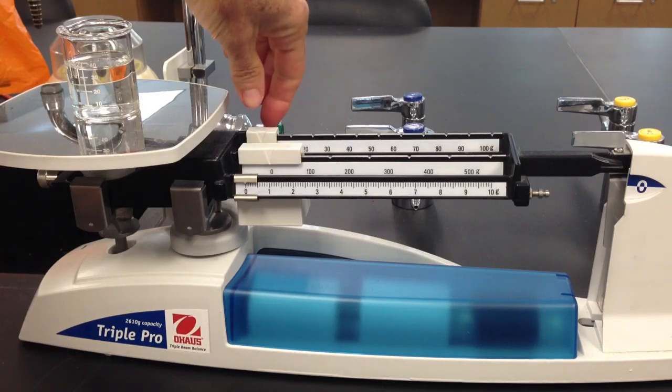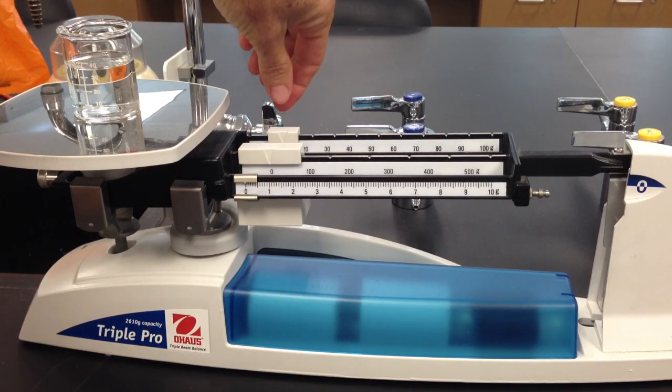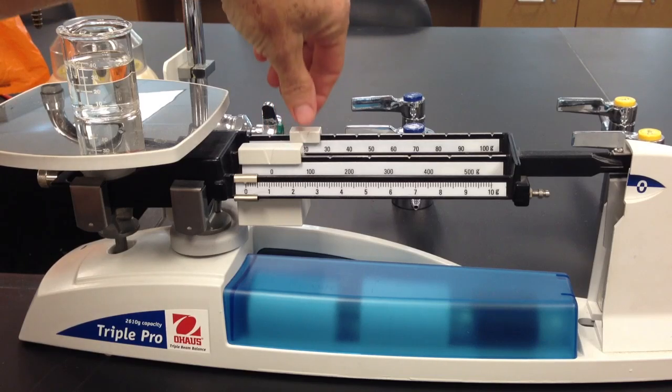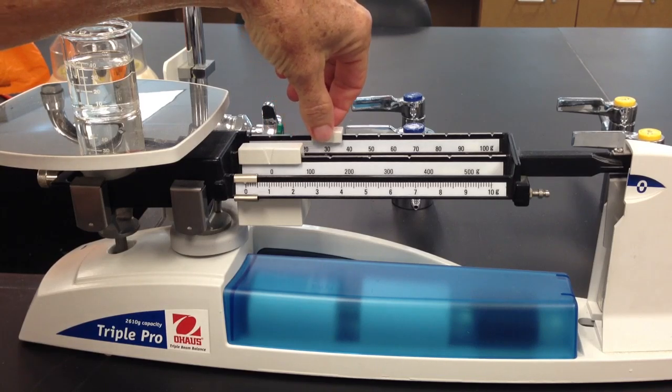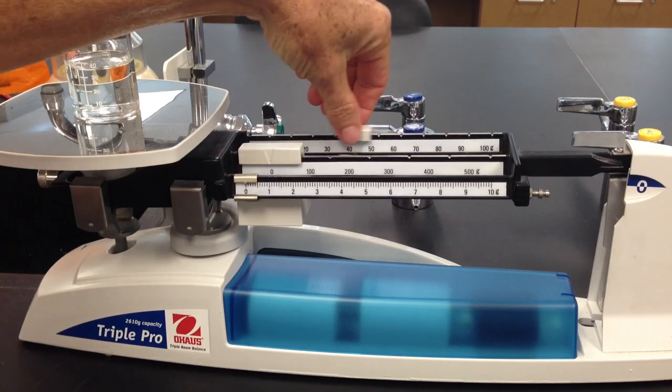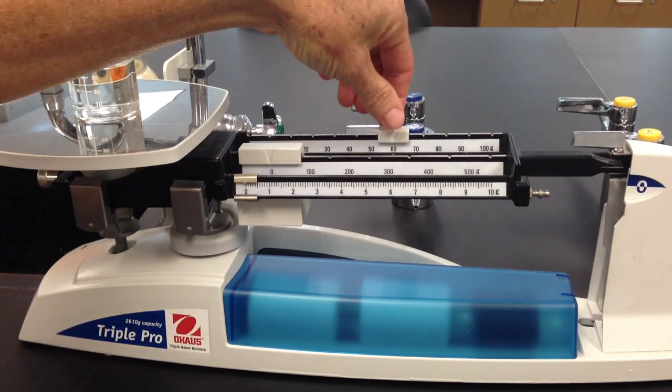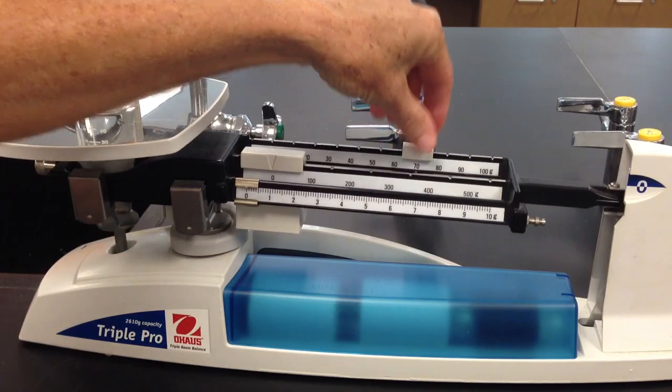We're then going to go to the tens beam and move the weight into the grooves until we find the mass that makes the beam fall too heavy. So we continue down: 50, sliding it right into the groove, 60, 70 is too heavy.